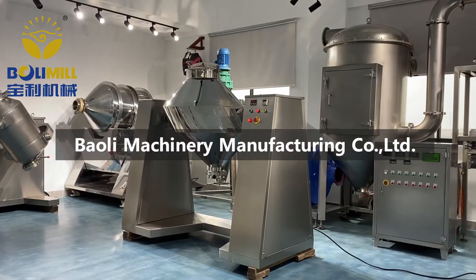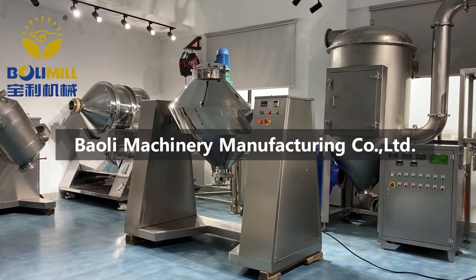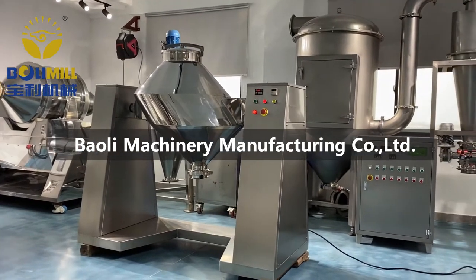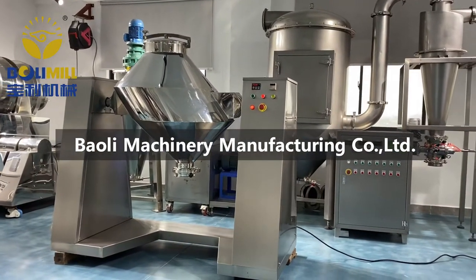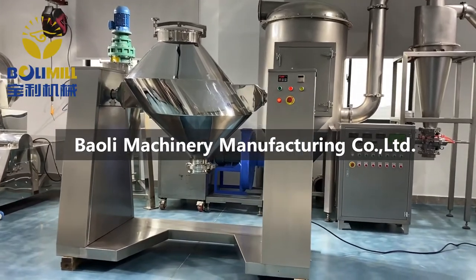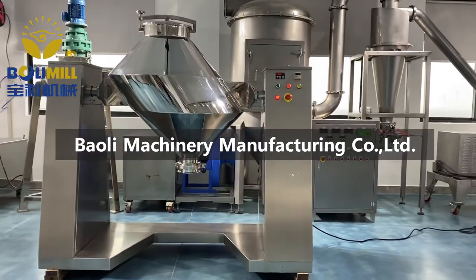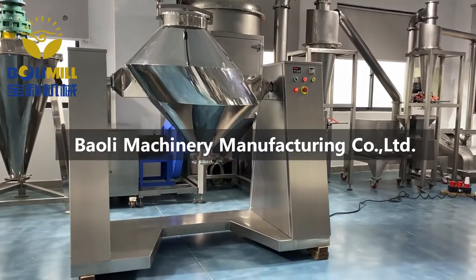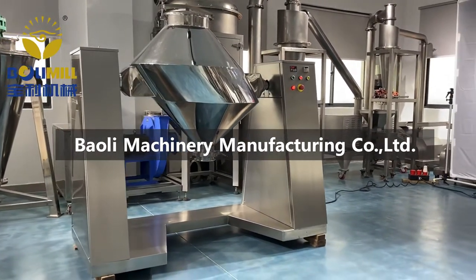This is a BW-type mixer. The BW-type mixer is used for high uniformity mixing of powder and granular materials in pharmaceutical, chemical, and food industries. It is suitable for mixing powders of health products, spices, and so on.